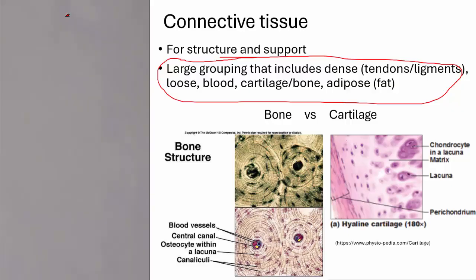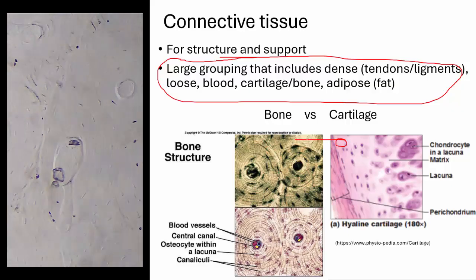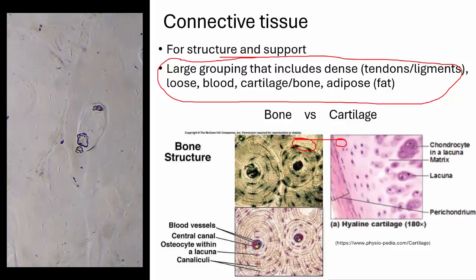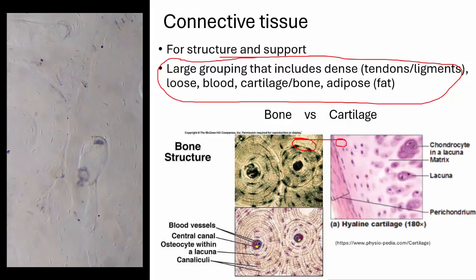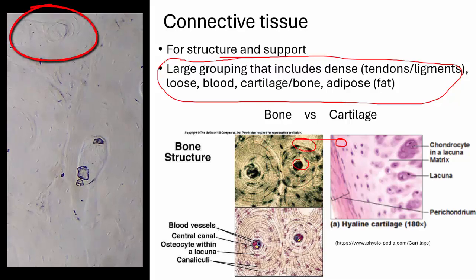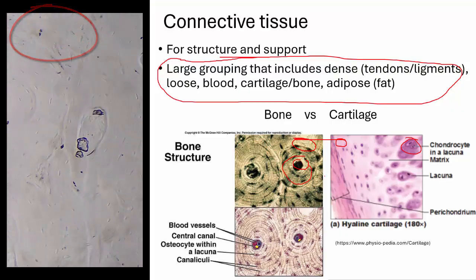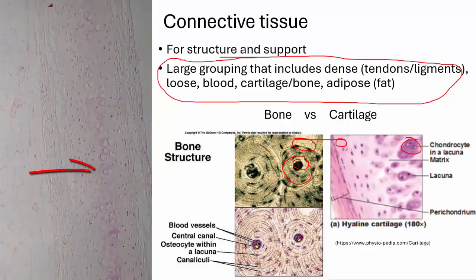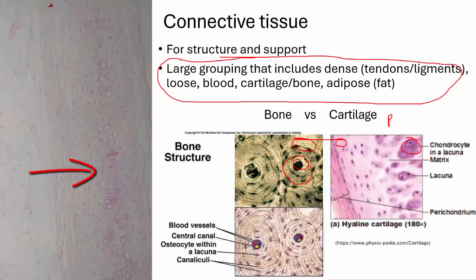Generally, bone and cartilage, it's just a nice smooth staining because it's just a pure sort of mineral apatite for the bone at least. And so you can see concentric circles for the bone. The cartilage is a little bit more random, but it does have those central cells that are producing that matrix that it's surrounded by.